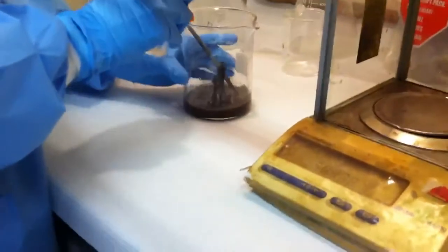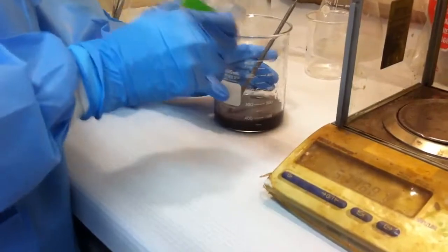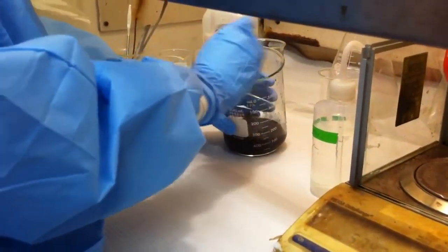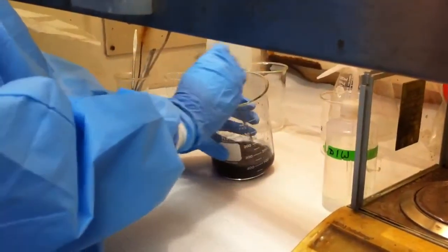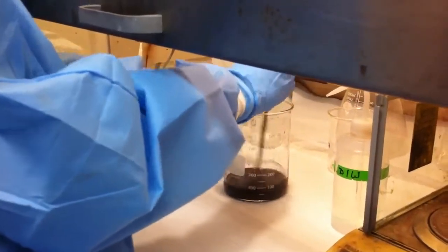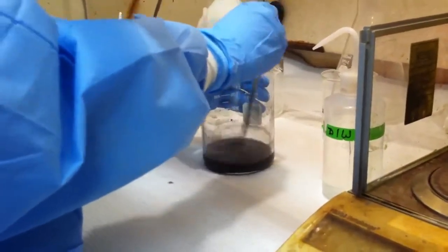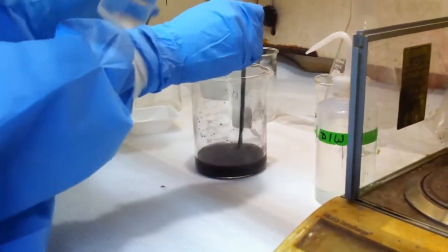The first step is to make it into a nice muddy concoction — that's using our DI water and the powdered cadmium. Then slowly start to add 10% hydrochloric acid.